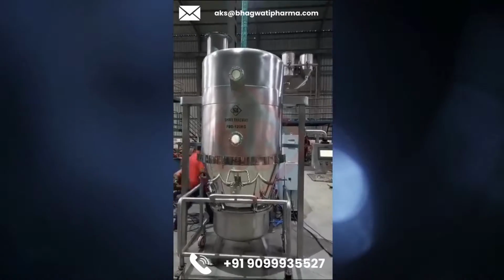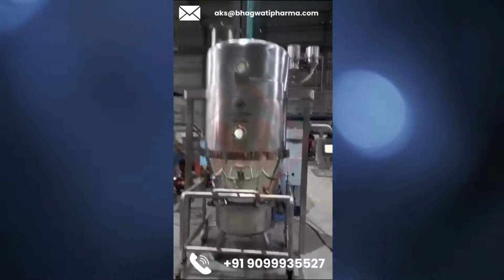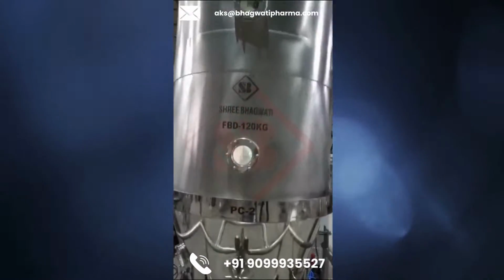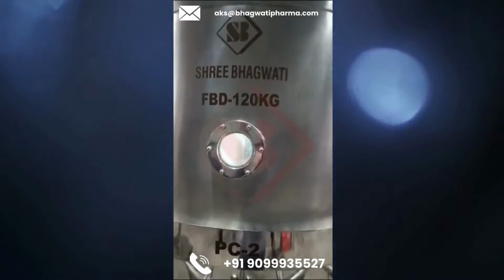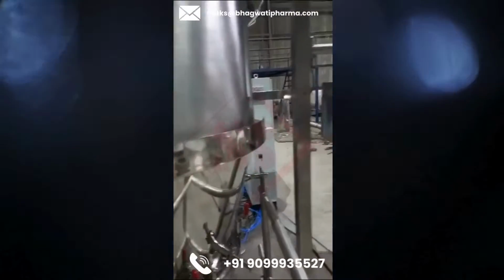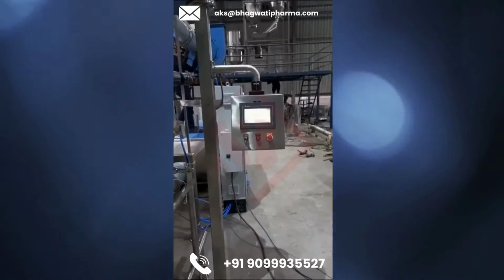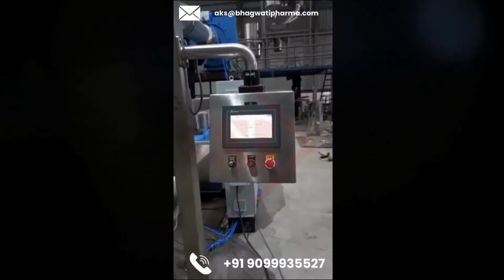A fluid bed dryer is a type of equipment used for drying granular, crystalline, or coarse materials. It operates on the principle of fluidization, where hot air or gas is passed through a bed of solid particles, causing them to become suspended and behave like a fluid. This fluid-like motion enhances heat and mass transfer, facilitating rapid and uniform drying of the material.